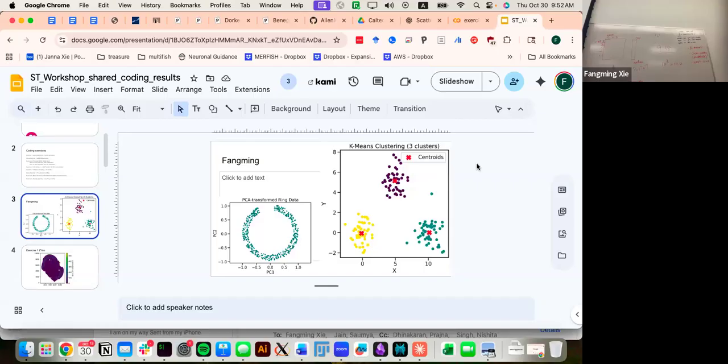Think of it as you have a big data set, and you choose a small k, although they might have chosen a different algorithm. And then for each of those groups, they redo all the analysis. By redoing, I mean they don't start from the same matrix. Before reclustering, you select highly variable features, and all these things are important.